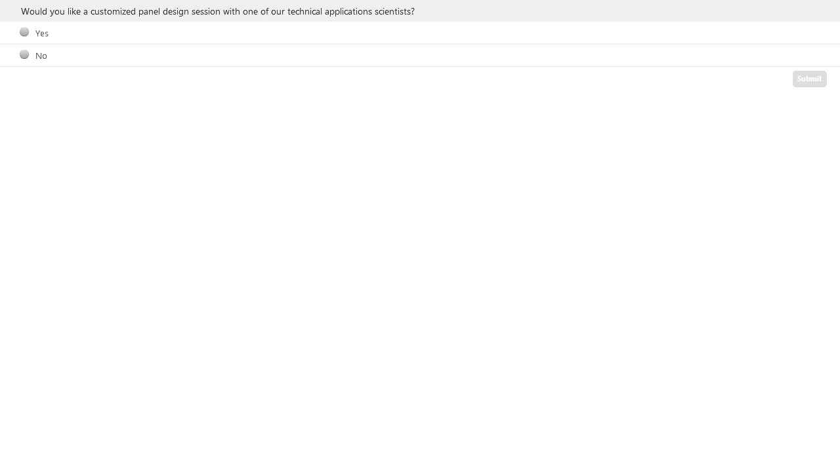So just to bring that question back, I think that spectral is a great way. I think that conventional flow is really, really good too. It's about what we see with biology. The best biology is that separation between a negative and positive across as many markers as possible, and its ease of use as we get higher and higher in the number of specificities we check. But the whole field of flow is not up there at 28, 30, 35, 40 colors at all. The majority of flow we use in our laboratories today is considerably less.